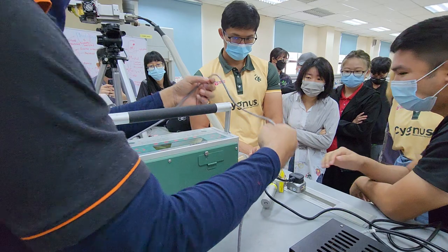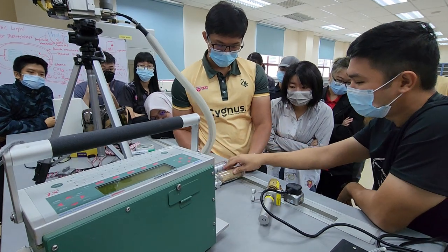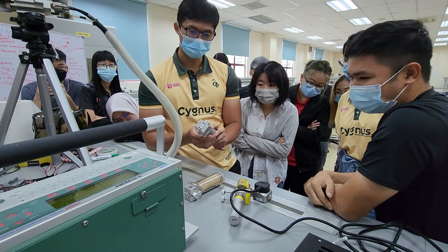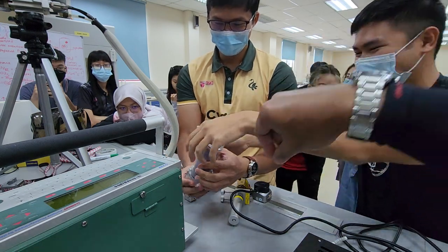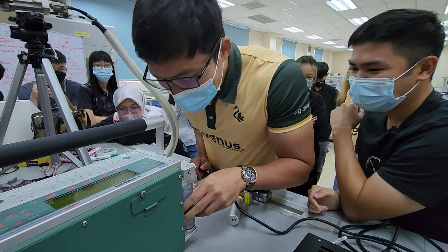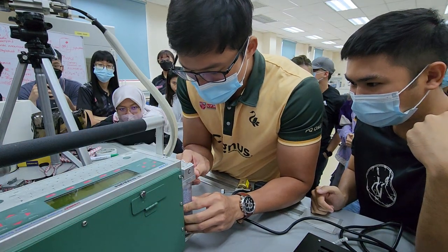Okay, so we have three chemical columns here. We have the desiccant, CO2 source, and CO2 scrubs. So which one is which part? You look at the labels. So first of all, this is this side. The other one, this one. One is to control the gas out there.